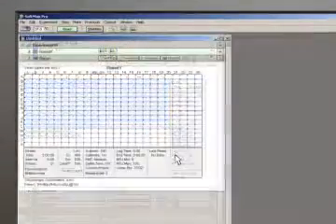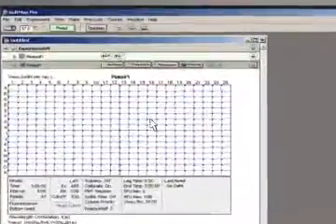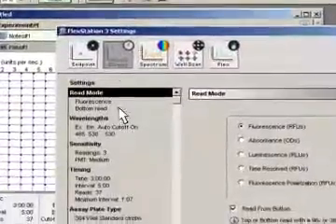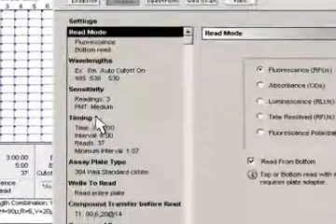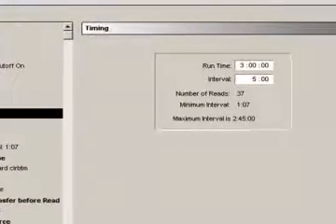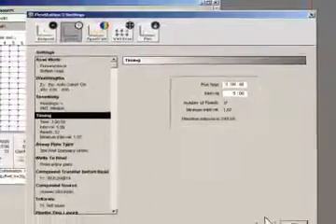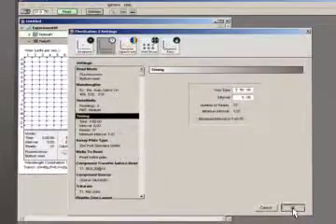You can also set up longer kinetic reads with an initial fluid transfer step. Here we have selected a total runtime of 3 hours, with the plate being read every 5 minutes.